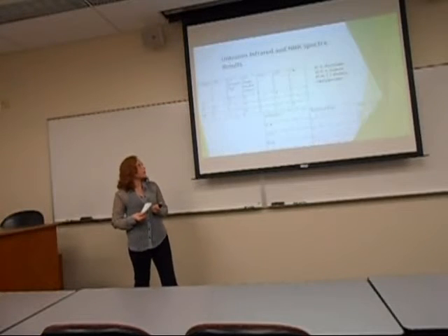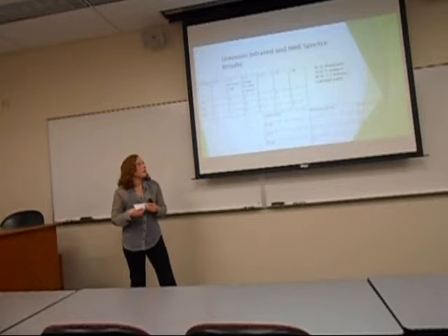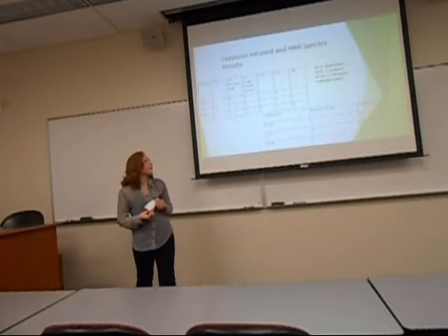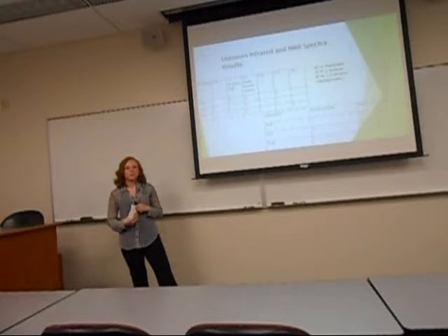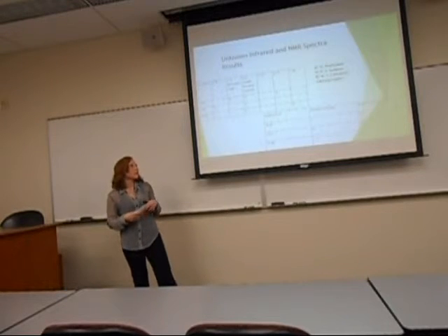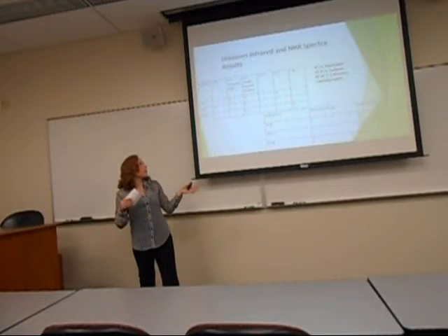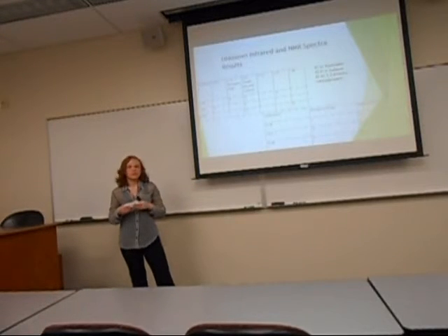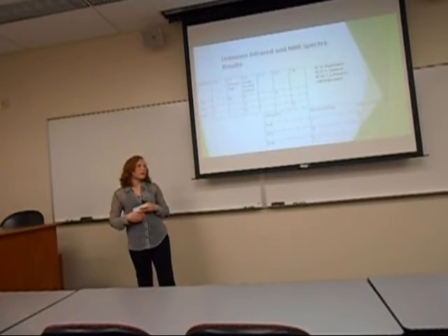of the compounds. My 3 unknowns were mesitylene, 2-butanol, and 1,2-dibromo-2-methylpropane. And these were kind of difficult to determine due to the way their graphs were, because some peaks weren't long enough to determine as peaks. But as I got down to it, they ended up being C to H benzene ring. There really wasn't a C double bond O, and their peaks were based on the graphs.